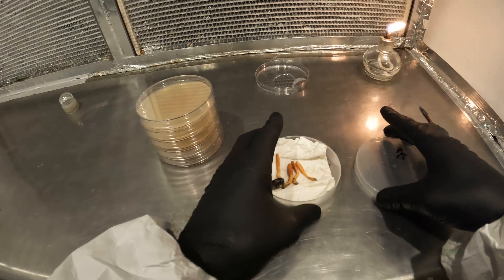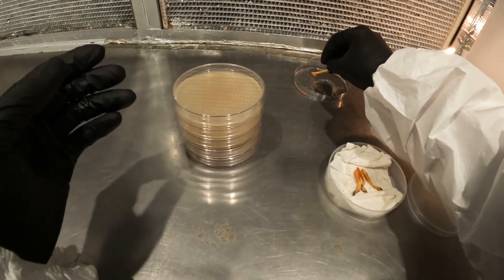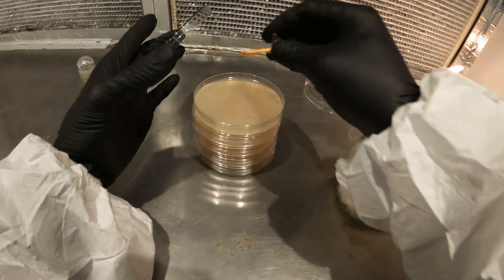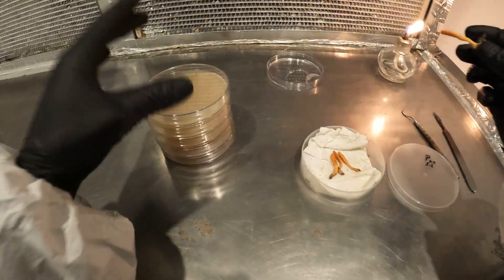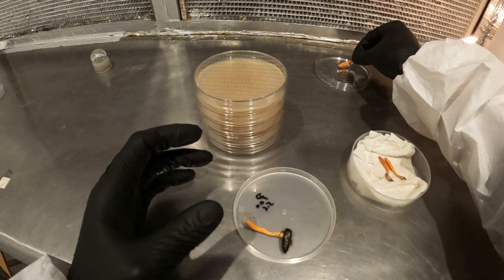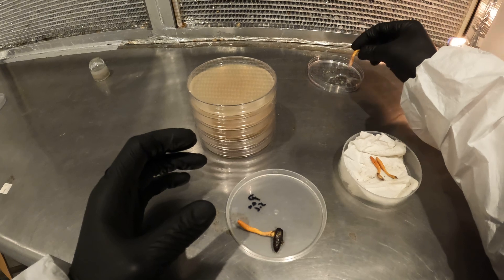There are a couple different ways I like to do this. This has hydrogen peroxide in it — I'm just going to dab a little bit of that in there to kill off some of the stuff. Then I'm going to take a plate here and swab the spores onto the plate. You can get a lot of junk on there by doing that, but once you know what you're looking for you can kind of clean it up. I can see the peroxide just bubbling up.